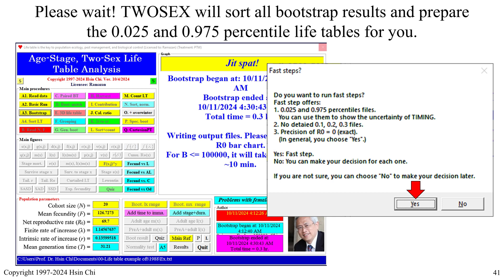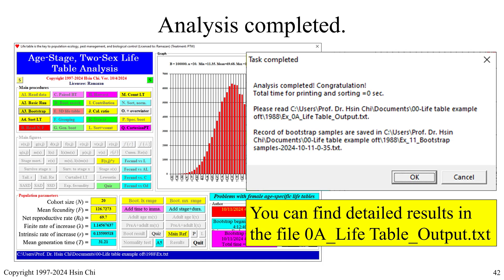2-Sex will sort all bootstrap results and prepare the 0.025 and 0.975 percentile life tables for you. You can click Yes to use the fast steps, or choose No to make your decision later. If you see the bar chart, the analysis is completed — congratulations! Click OK.